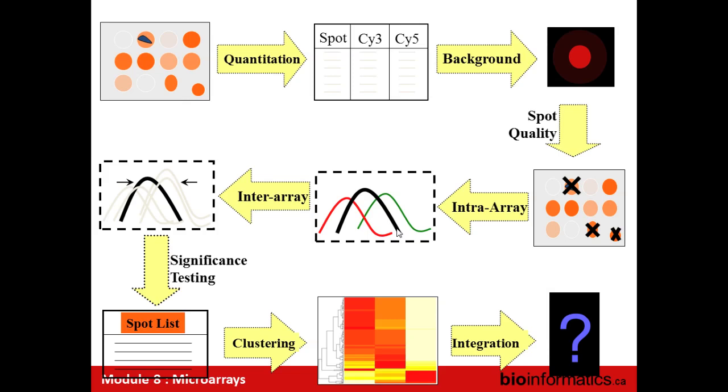Yeah, good question. So imagine that your scanner was perfect, then yes, you absolutely could. But that would require something like a photon-level scanner. We certainly don't use those. I don't even know if they exist. You can detect single photons, but nobody uses that for microarrays. So the scanners that we have use much more thresholds of intensity. Now, how low it is in terms of molecules per cell, I'm not sure. I think it's on the order of 1 to 2 molecules per cell, but I need to really double check that.